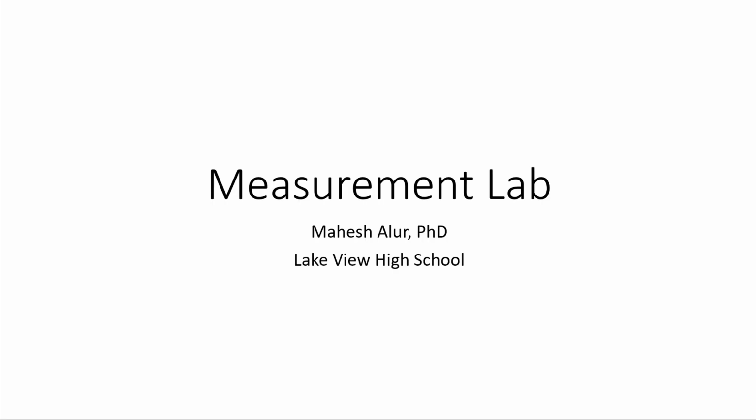Hi class, so in this video I'm going to talk about the measurement lab that we did. The main purpose of doing this measurement lab was to have you be familiar with some of the tools that we use in a classroom to be able to do measurements, but also how that relates to significant figures, which was one of the early quizzes that many of you took.